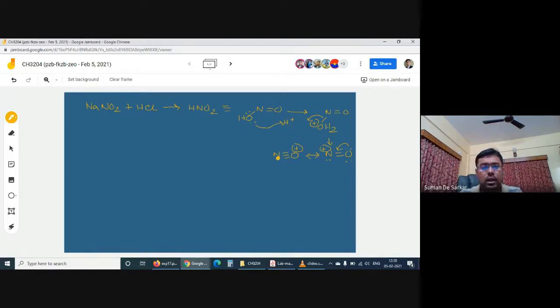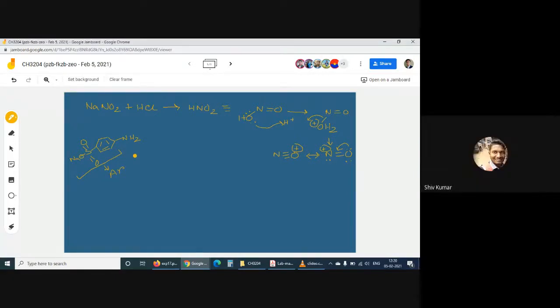If you check the procedure, what we added there is this acid with the amine group present, NH2, and as Professor Haldar mentioned, just to make it dissolve, we have made a sodium salt. Now onwards, because it's a big group, just to make it easy, we'll designate this as aryl group.